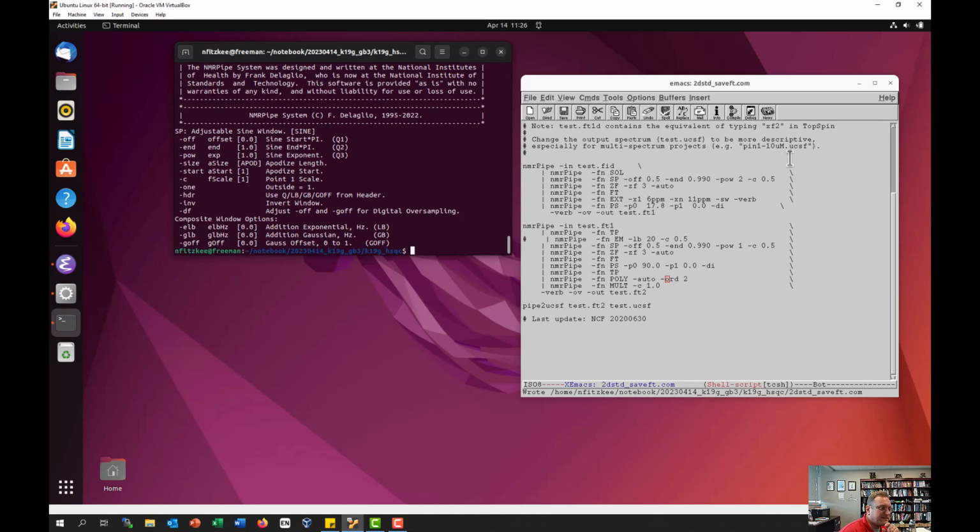The last thing I want to mention is that in the previous video I said that this pipe focuses on taking the output from the command on the left and pushing it into the command on the right. Since these are all on multiple lines, we need one little trick, and that's what this backslash is doing here. The backslash tells Unix that when you interpret this command, ignore the next character. If you look, notice the cursor switches a little bit. This is the end of the line. So what this backslash says is, ignore the end of the line and continue processing from the next line.